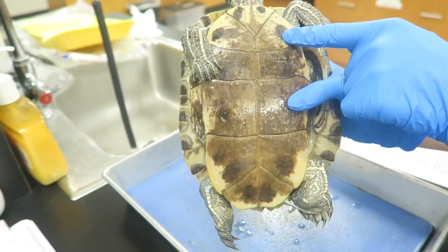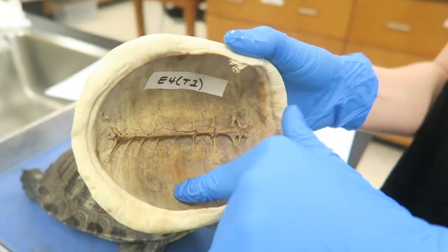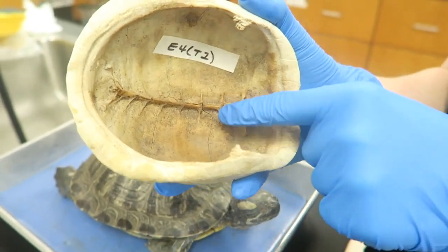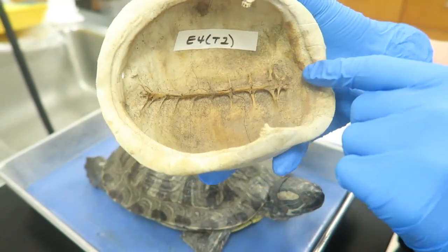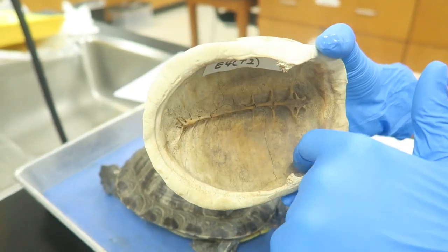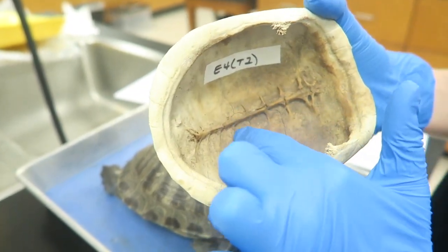On the ventral side there are six different layers of scutes: the gular, humeral, pectoral, abdominal, femoral, and anal scutes. On the inside of the carapace you can see the dermal plate and the vertebra, which forms the spine. The vertebrae are fused to the carapace and extend out to form the ribs, making up the axial skeleton. This fusion creates support and stability for the carapace. There are also peripheral plates on the outside, costal plates, and neural plates which are under the vertebra.